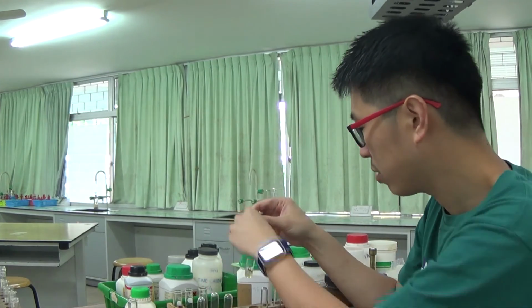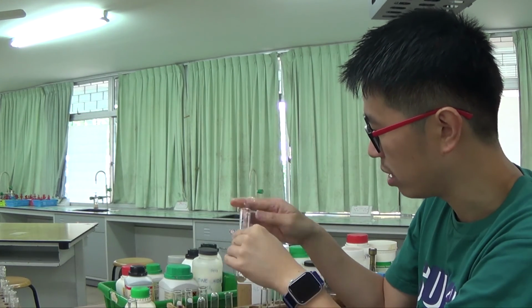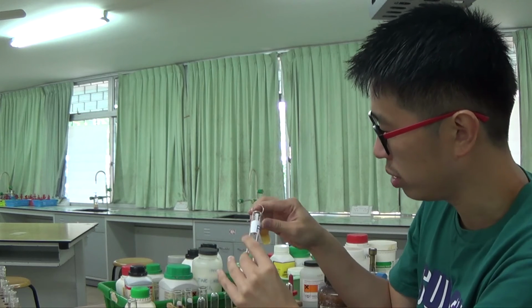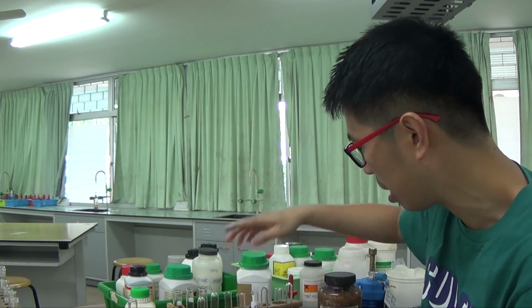First portion, I'll test for the anion, which I already knew was sulfate, so obviously it's just the barium nitrate test or barium chloride test. Second portion, I'll test with ammonia, just to show you that we can. And the third portion, I'll test with sodium hydroxide, to test for the cations.